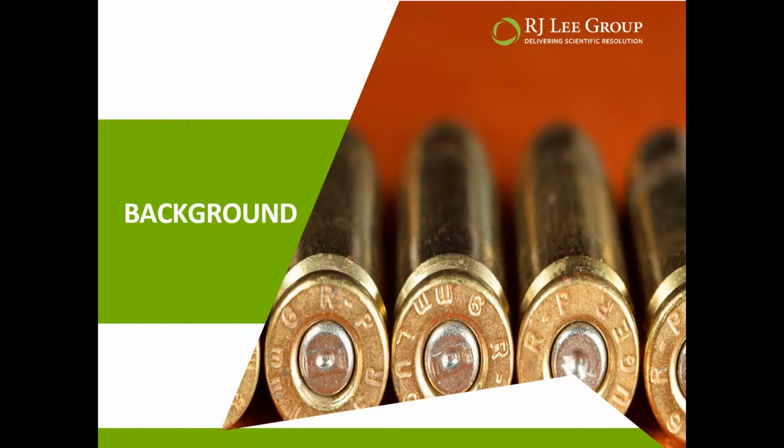In that primer cap, there's something called the primer mixture or the primer paste. The primer paste is made up of elements, specifically and typically a combination of compounds known as lead styphnate, antimony sulfide, and barium nitrate. Now, I don't want to get too technical into any of this, but suffice to say, it's the combination of those three inorganic elements, lead, antimony, and barium, that create the primer gunshot residue that I'm looking for when I'm analyzing a sample.